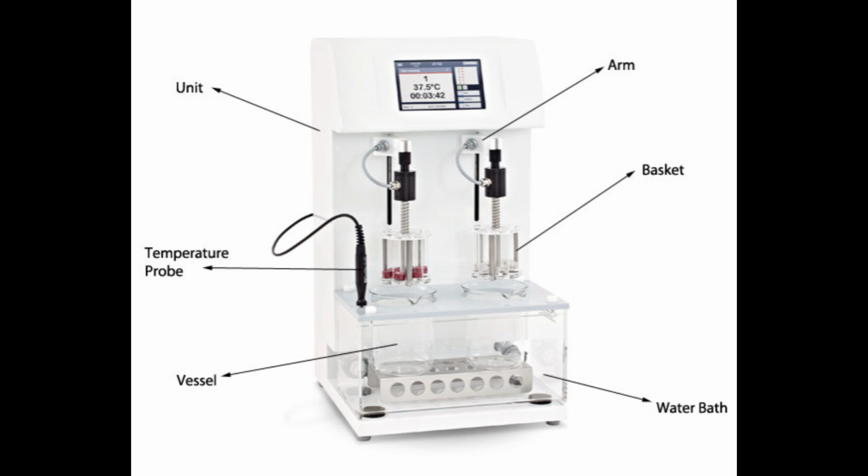2. Fluid penetration and mechanical stress. Wicking: liquid enters pores by capillary action, weakening interparticle bonds. Swelling: disintegrants swell, creating internal stress that fragments the matrix. Strain recovery: compressed particles rebound upon wetting, accelerating breakup. 3. Endpoint determination. Complete disintegration: no residue on the mesh except soft masses or insoluble coatings.